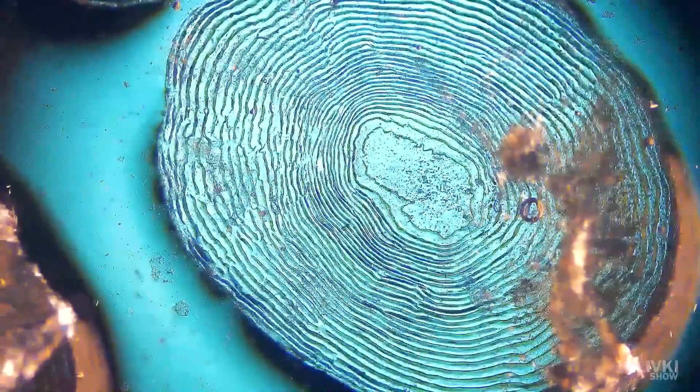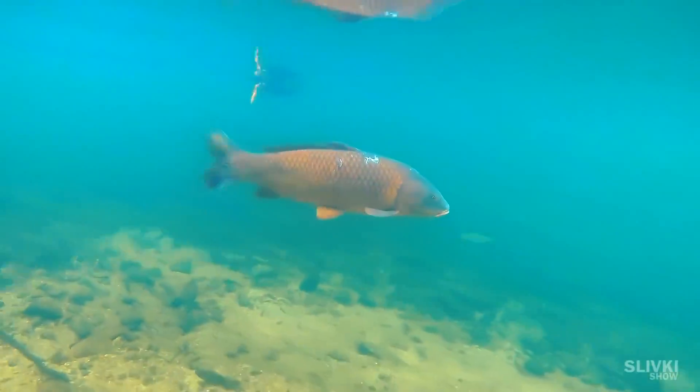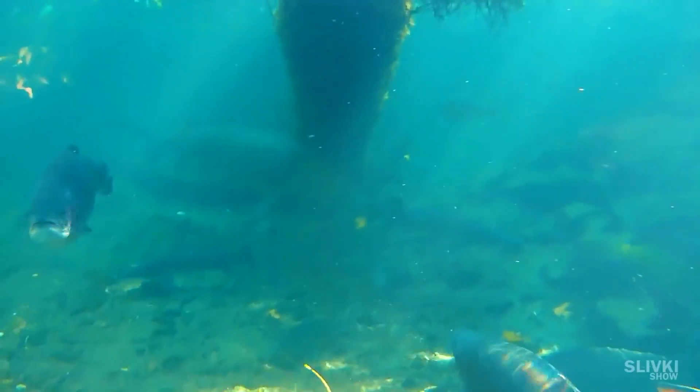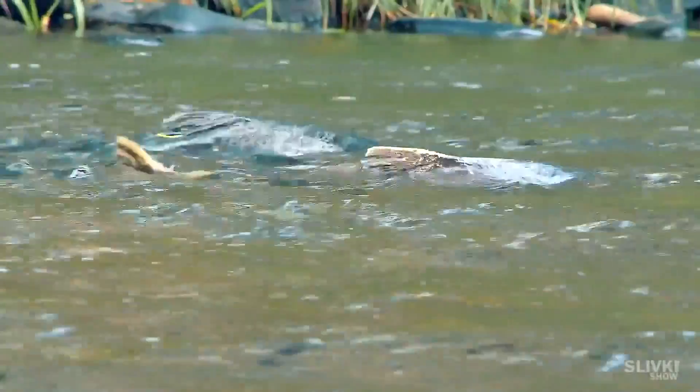Scales give the body of a fish a streamlined exterior and reduce resistance to movement in the water, by smoothing out faults and irregularities in the skin formed during movement. They also have a protective function during collision with branches or sharp rocks.